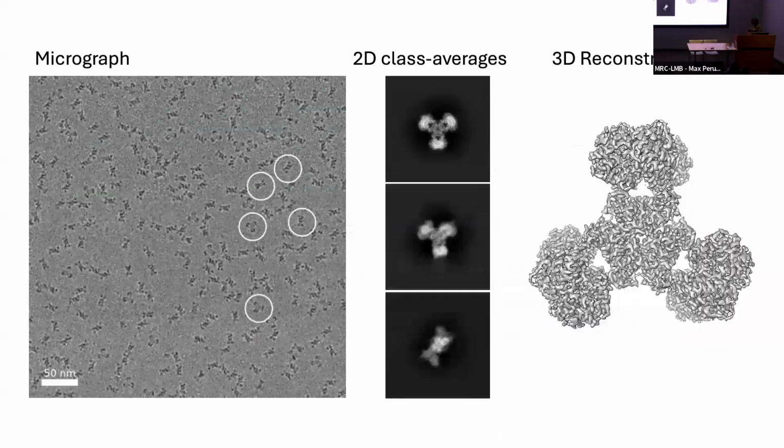Yeah, this is Giuseppe's project. Very good. This is some kind of enzyme. He took the pictures and did the processing. First, you do 2D classification. Just put all the similar orientations into one group to improve the signal to noise ratio. Otherwise, this is a good image, but normally it's very, very noisy. You cannot really see the particle, but this is one of the very good ones.